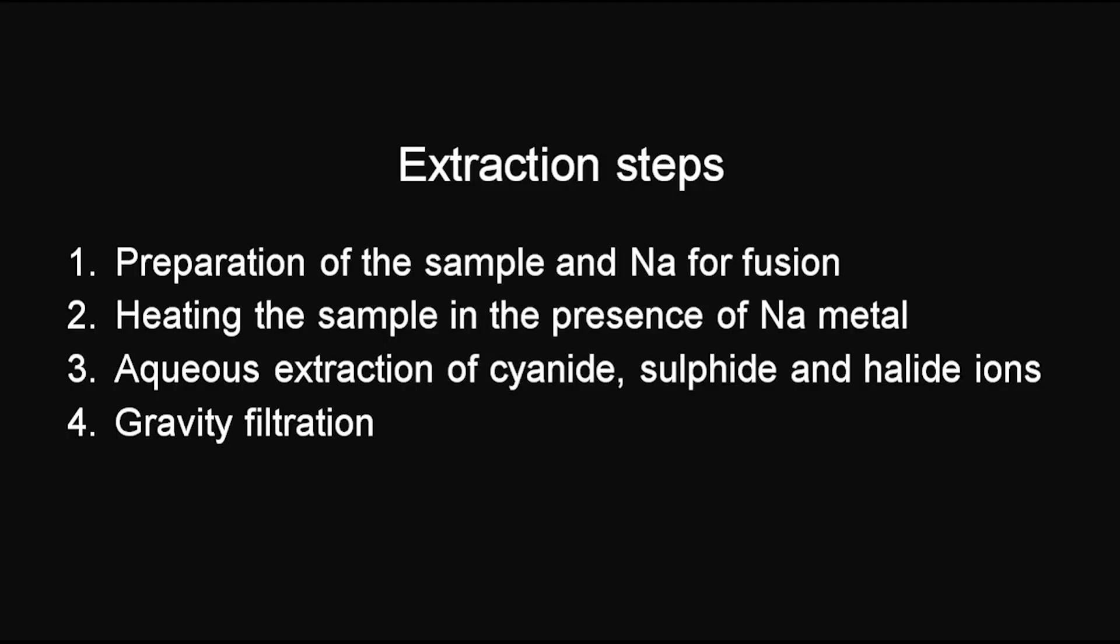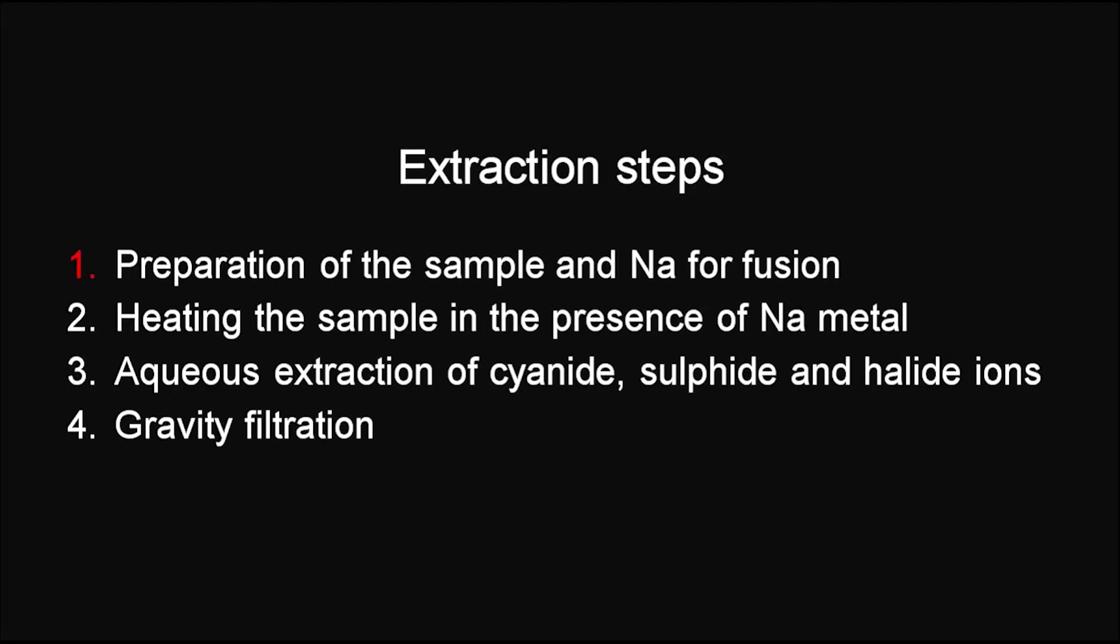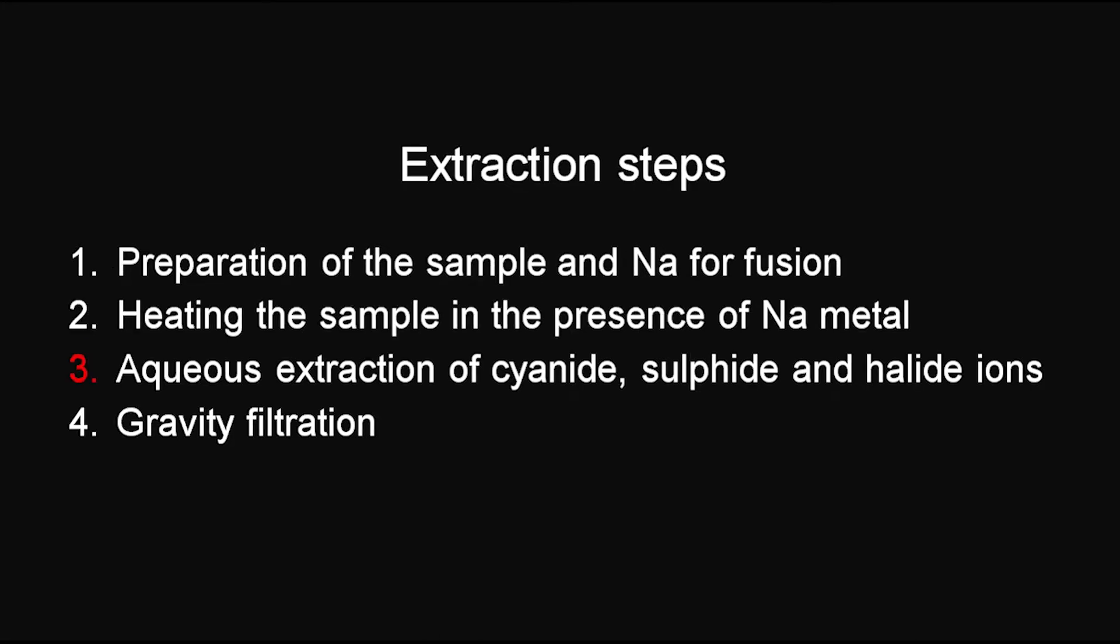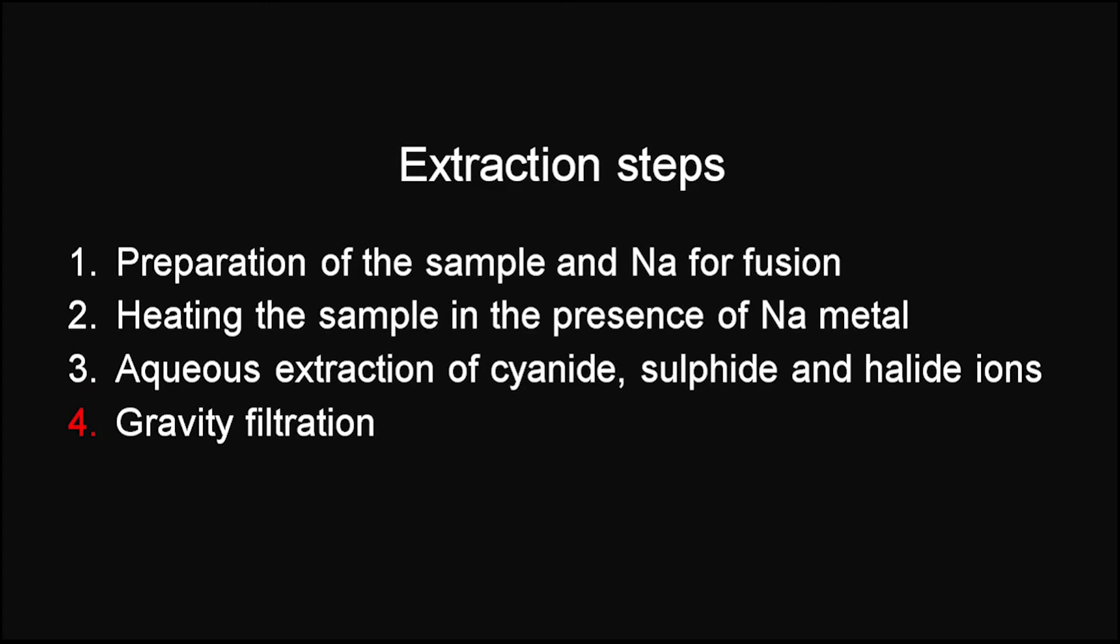The procedure involves four steps. First, the unknown and sodium metal are prepared for fusion. Next, the unknown is heated in the presence of sodium metal. Then, the ions are extracted. And finally, the resulting solution is gravity filtered.